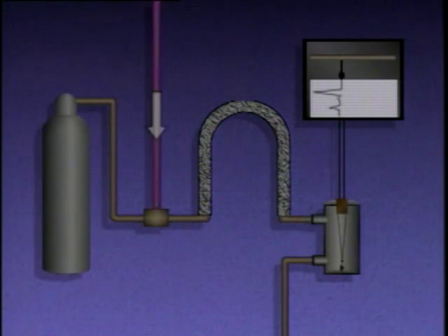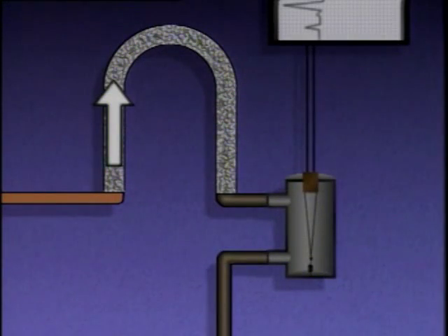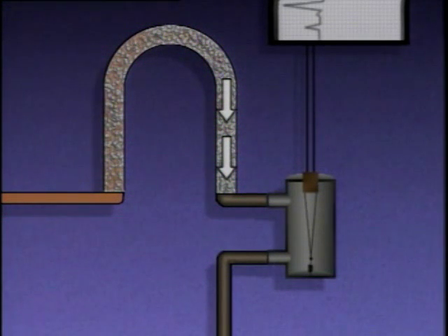During operation, a sample of the gas being measured is fed into the chromatograph through the sample gas inlet. The carrier gas is then used to carry the sample gas through the column of packing material. Different gases flow through the material at different speeds. So the packing material separates the sample gas mixture into its individual gases.